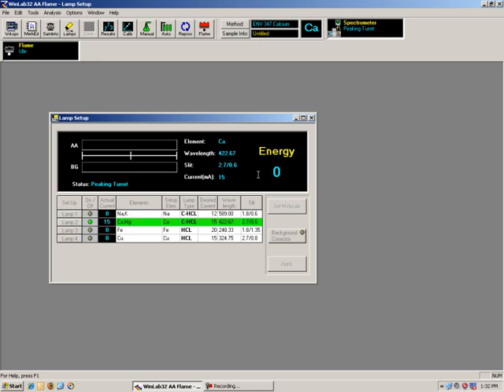The light beam in this case is the reference light beam that the mirrors directed around the flame, and we're just trying to get it to reach a maximum. So it's peaking on that wavelength right now. You can see the self-checks going on. And in the background you can hear various things being moved around, adjusting that lamp again to get that maximum energy. When it reaches that point, it'll display that energy.